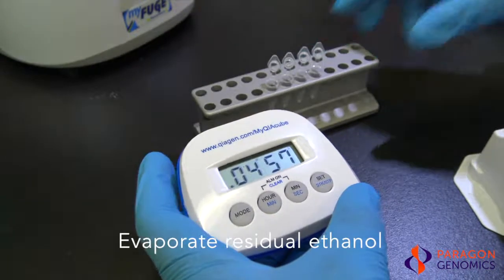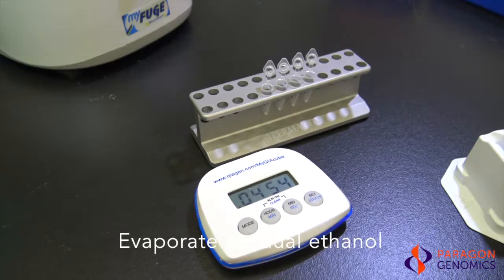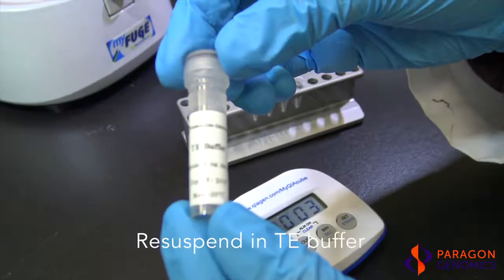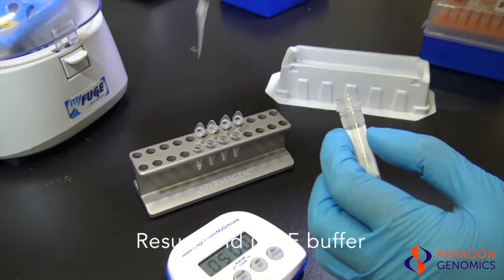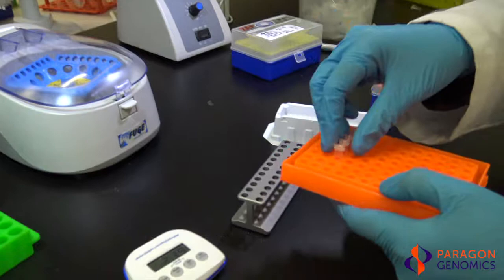Dry the magnetic beads for approximately 5 minutes with the tubes uncapped. After 5 minutes, add 10 µL of TE buffer to re-suspend the magnetic beads. Vortex thoroughly until all the beads are in solution. The sample is now purified and ready for the next step.